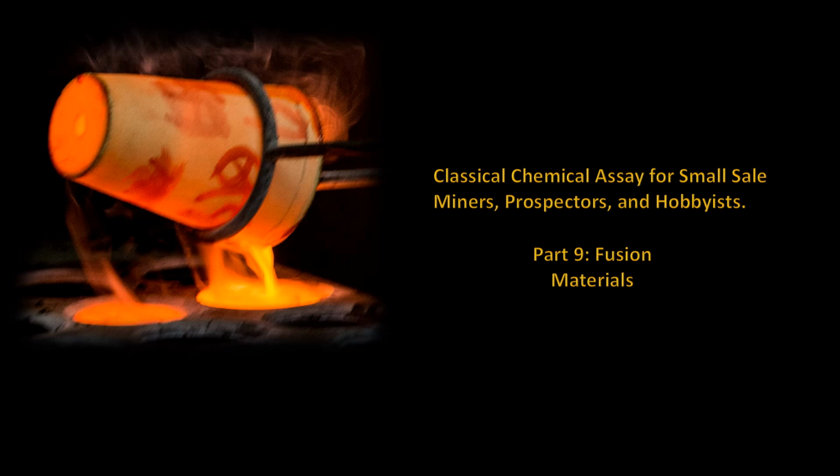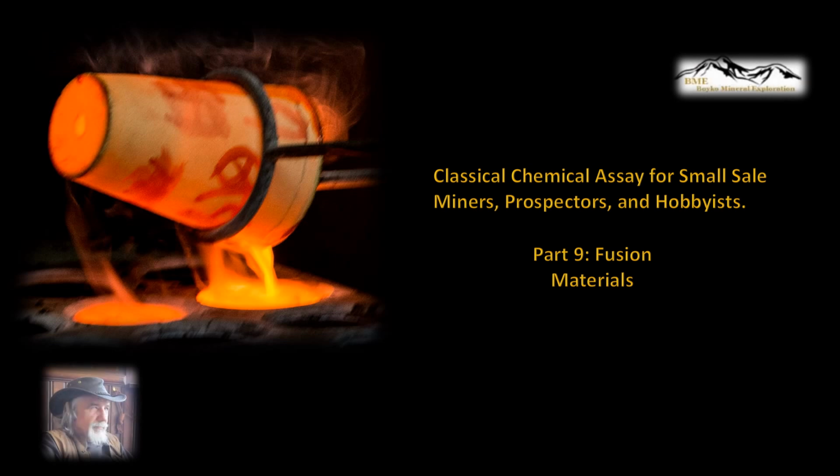Now, I stated that refractory materials are resistive to dissolution in acids. These materials require a different approach for total dissolution. Therefore, in this presentation, I will be discussing the dry part of the wet-dry method of dissolvement. I am Rob Boyko, Boyko Mineral Exploration, and welcome back.